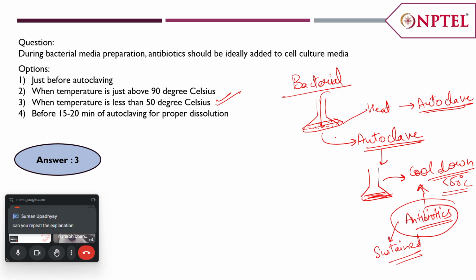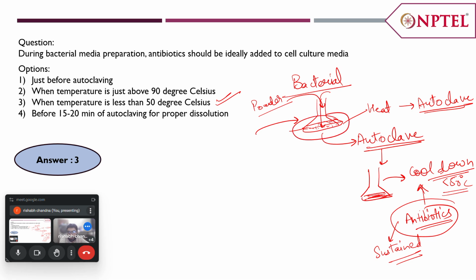Okay. So what happens whenever we prepare a bacterial culture media? We have two kinds of preparations. First, all the components are in powder form that you directly add, and a defined amount is added for a defined volume of the media that we are going to prepare. The other one is, there are different components, you add them and mix them with the media, also with the water. In the initial times, people used to first heat the media and then autoclave it.